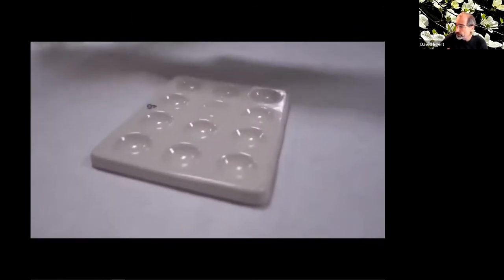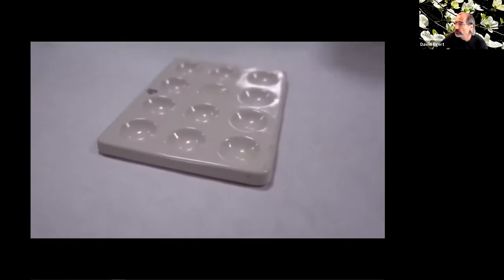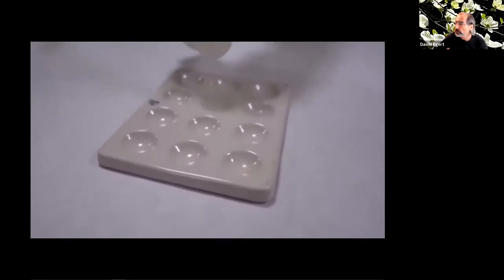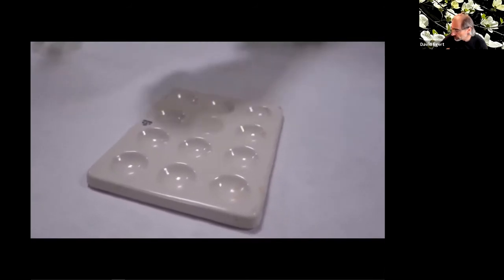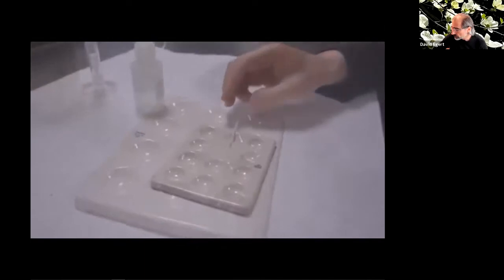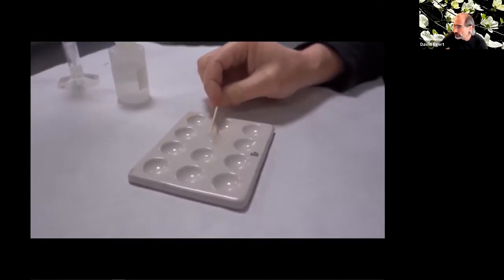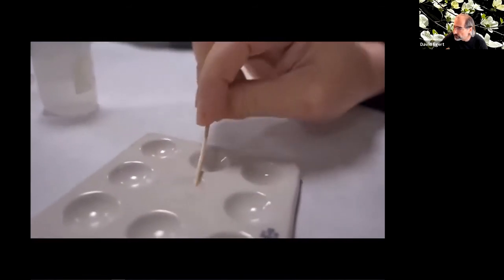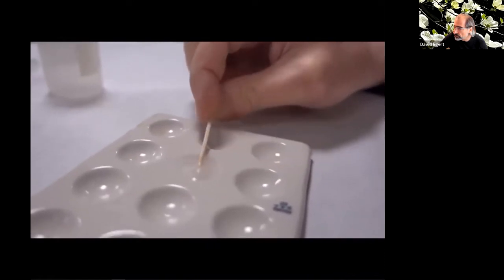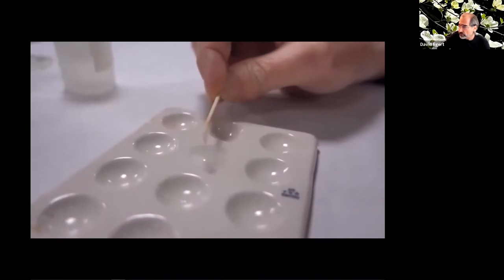A mL or so of saliva. And this is acetic acid, basically diluted vinegar. It will actually precipitate out the mucins, the mucus part of the saliva. Now use a toothpick. We can see, look at that, all those gooey, goopy strings there. Those are the mucins that are the other component of your saliva that help bind and lubricate your food.